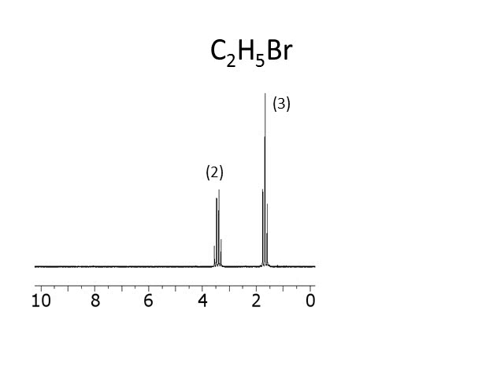All right, so let's just start out with a practice problem here. C2H5Br. Yes, this one's obvious, hopefully, in that you could draw out the Lewis structure just based on the formula, but let's look at the spectrum.